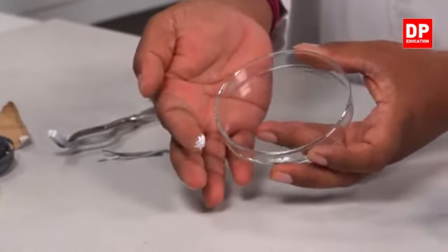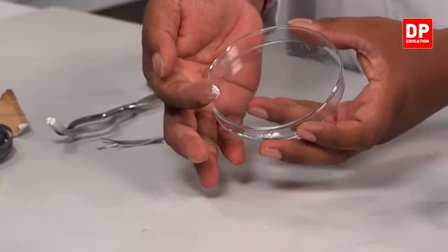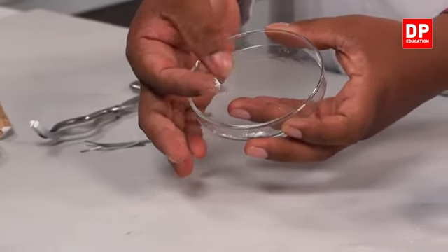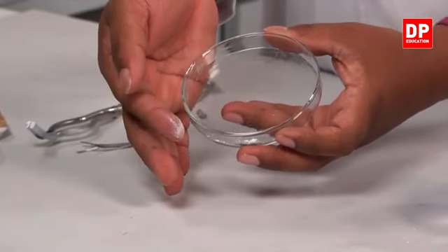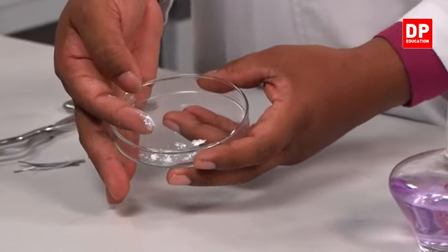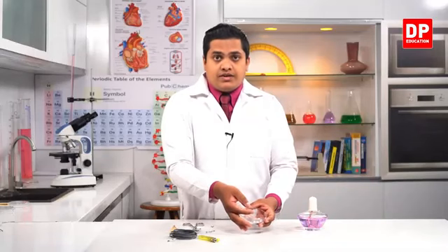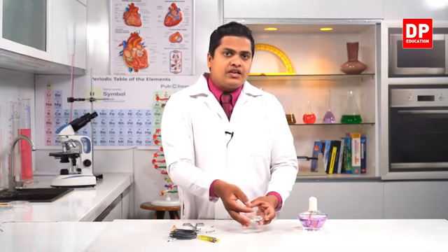See, it's a white color powder right now, right? It's a white color brittle powder. Brittle means breaking down quite easily. So here you can observe the white color very well. This white color powder is referred to as magnesium oxide, because during the burning process, magnesium is joining with oxygen, or it's burning with oxygen.